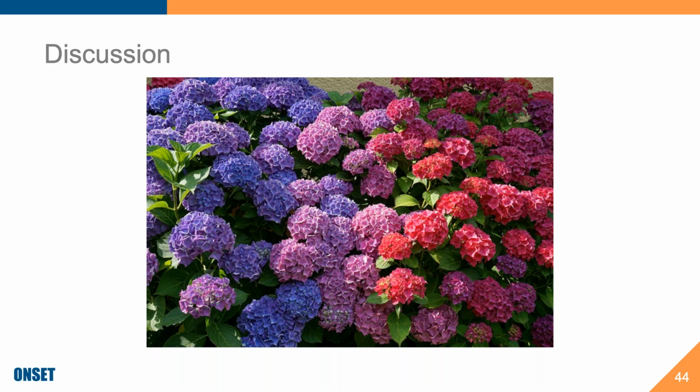And when you're calibrating, it takes into account the temperature of your calibration solutions, and then the equation or the algorithm that is used to convert your potential and your temperature readings will then therefore be temperature compensated as well. You don't need to do this. It does it for you in the software. So that, I hope, answers your question.